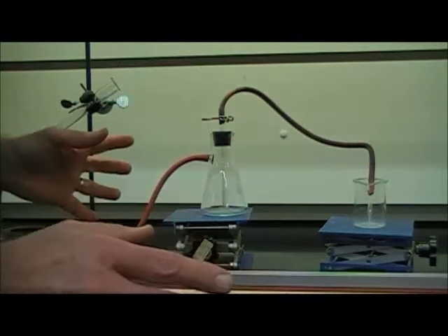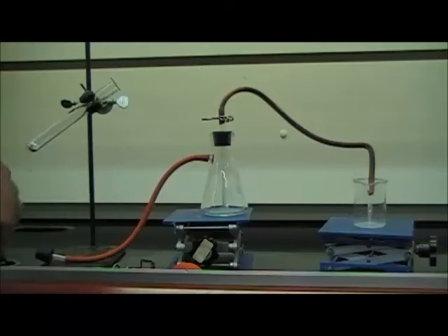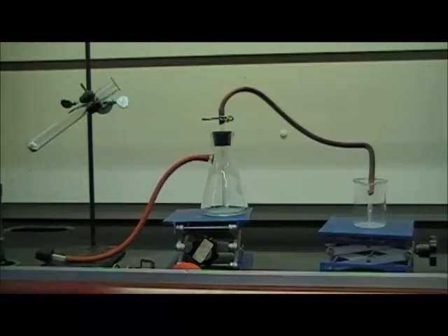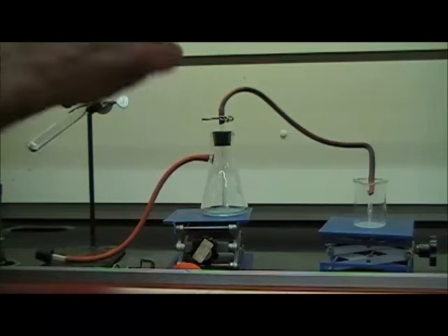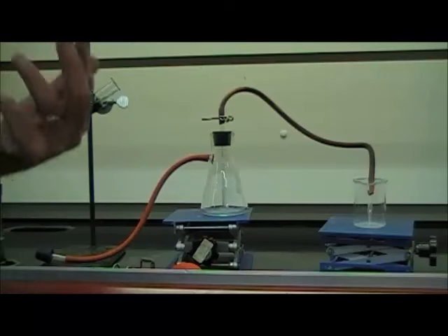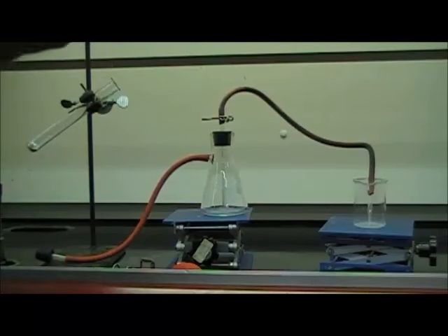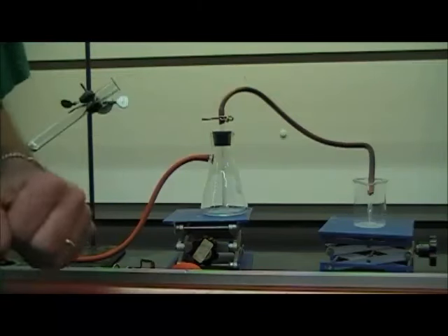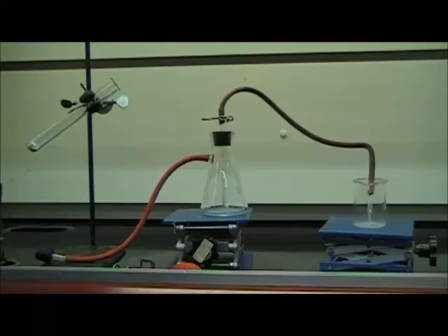We'll measure what the total temperature is in the apparatus. We'll measure what the pressure is in the apparatus in a very ingenious way, because the pressure in the apparatus is going to be the same as the atmospheric pressure, which we can measure easily. And we'll know the number of moles because we'll take the mass of the test tube before we started and the mass of the test tube after we finish, and the difference will be the weight of the oxygen that was produced. And if you know the grams of oxygen, you know the moles of oxygen. So we'll have moles, we'll have pressure, we'll have temperature, and we'll have volume, because we'll know the volume of water that came over. So that's the main idea.